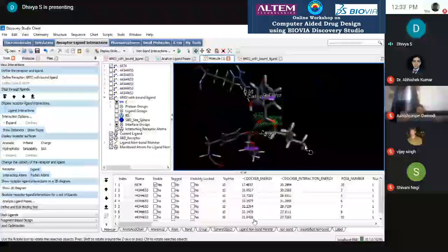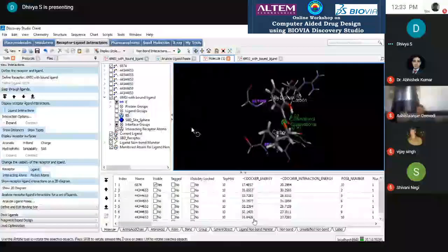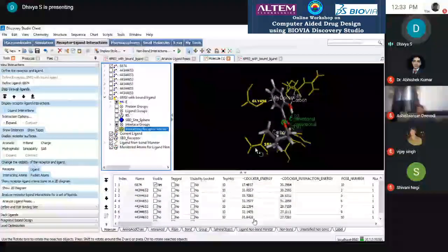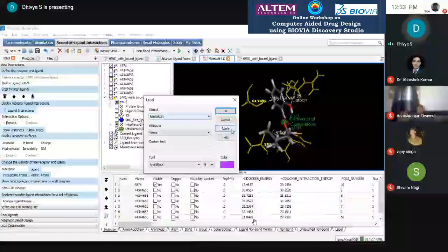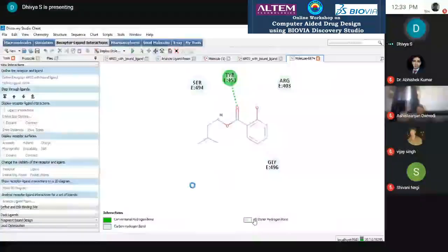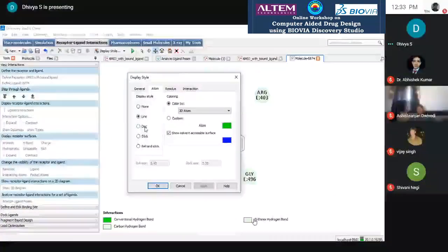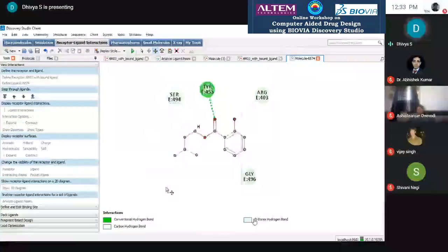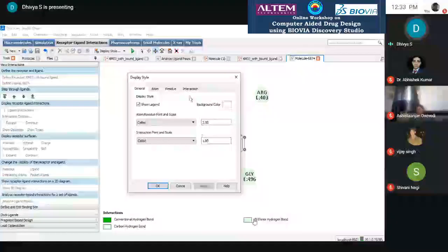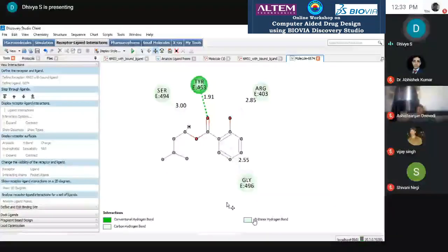You can show the type of interactions. Usually you see only the 3D view, but here in surface view you can also see it in the 3D representation. You can also create a 2D diagram for good representation. Change the diagram settings, apply, and it looks much better. Select 'Show Distance' and apply — this is how we select and analyze our docked complexes.